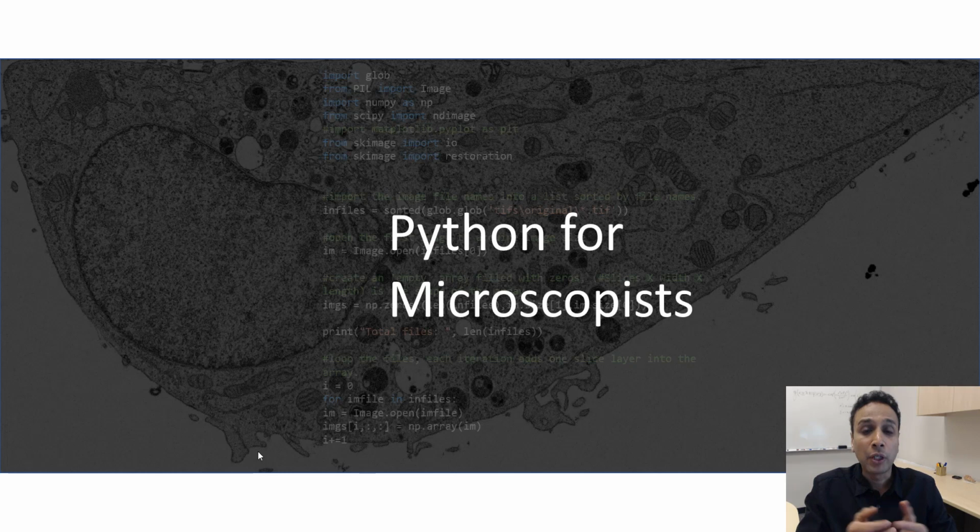What is the distribution of mitochondria or nuclei in your images, or inclusions if you're looking at material science samples, different minerals if you're looking at geological samples. So eventually you would like to quantitatively extract some information from your images, so you don't really need all that high signal to noise. If you can get the same information from low signal to noise, why not go ahead and do that? So whether you want it or not, there will be some noise in your images.